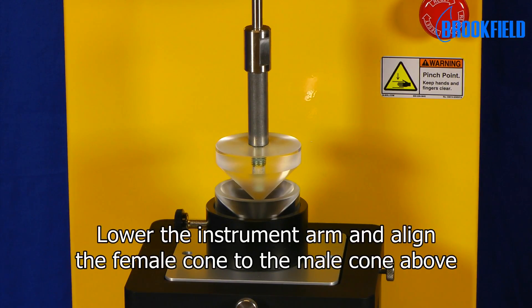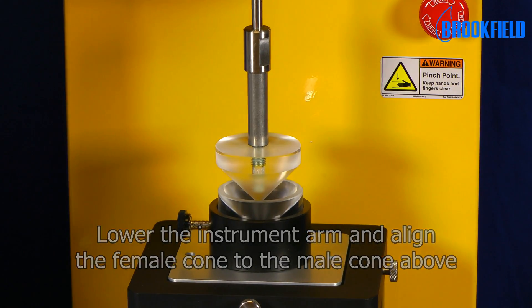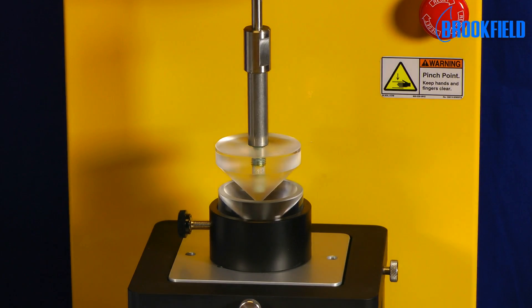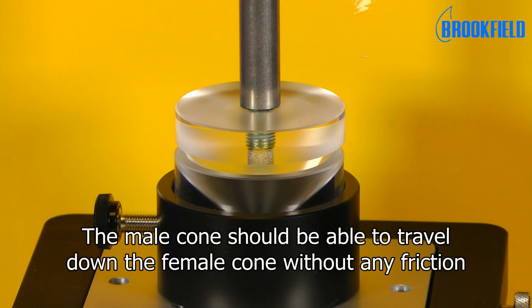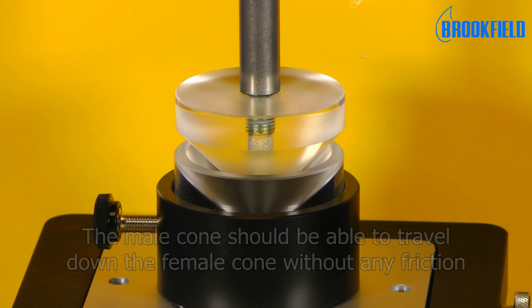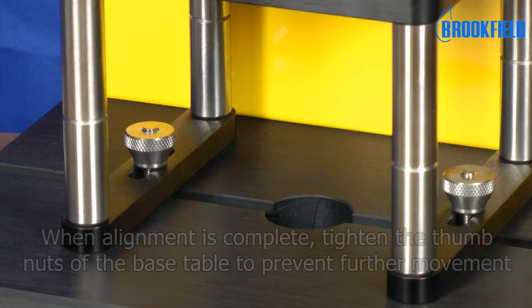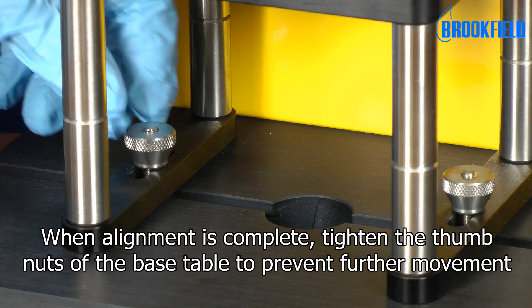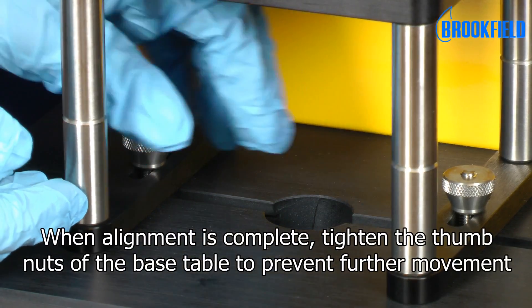Lower the instrument arm and align the female cone to the male cone above. The male cone should be able to travel down the female cone without any friction. When alignment is complete, tighten the thumb nuts of the base table to prevent further movement.